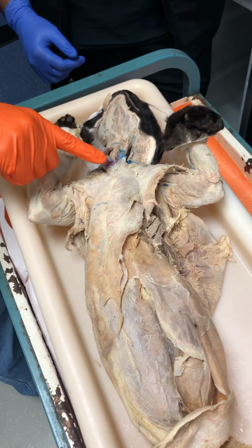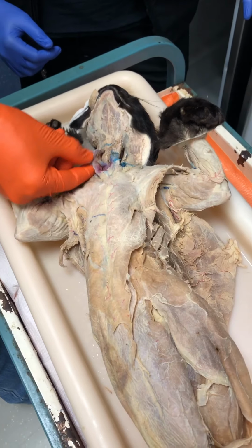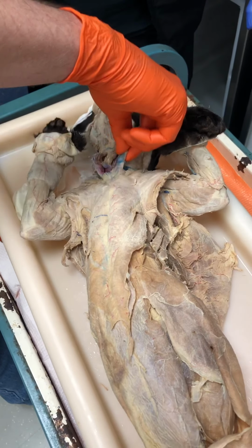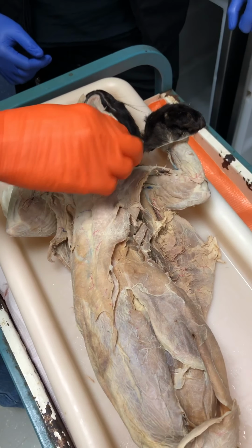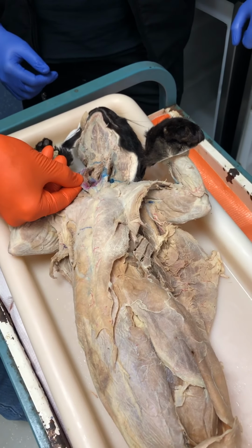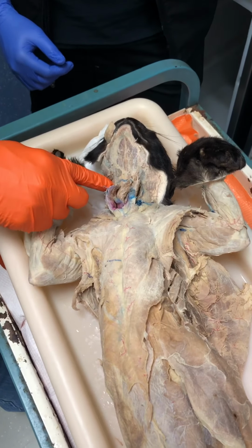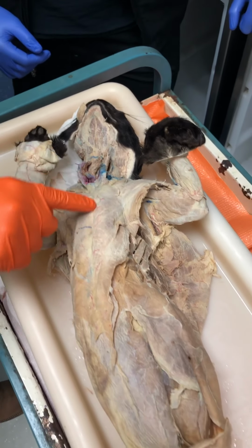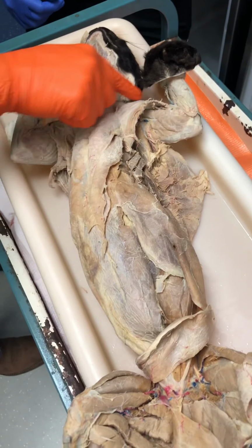And then you have these muscles here running from the sternum of the cat up towards the mastoid process. You see them on either side. In the cats, they actually have two. They have a sternomastoid and a cleidomastoid, but we just call them sternomastoid, or you can call them sternocleidomastoid. In humans, they have two heads down here and they come to one insertion. And then this large triangular muscle here going all the way out to the elbow, that's the pectoralis group.